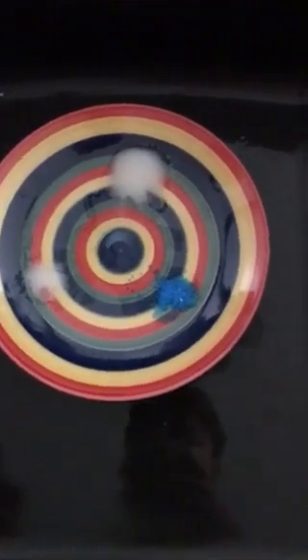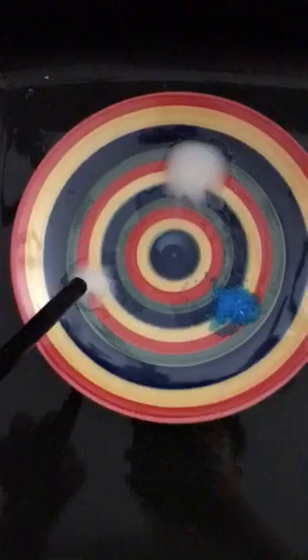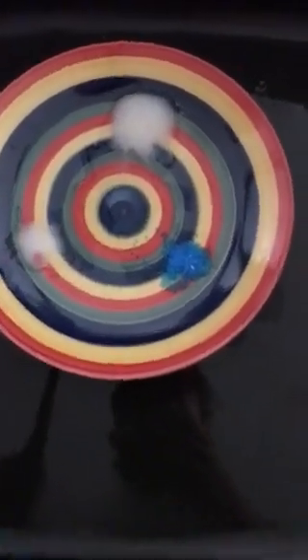Right here I will be burning cupric sulfate, salt, and strontium chloride. Right over here we have the salt, the cupric sulfate, and the strontium chloride. In the middle I have a gathering of alcohol.